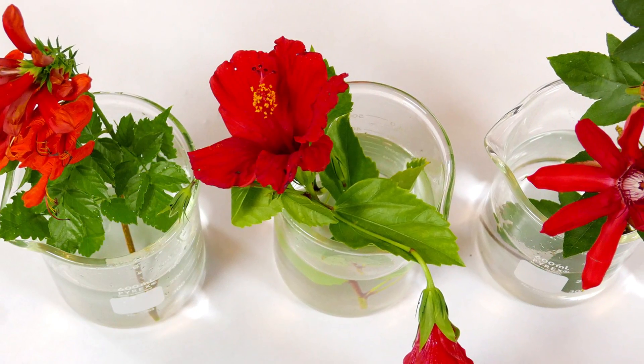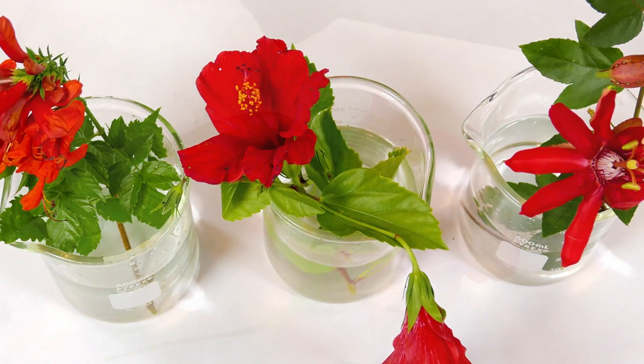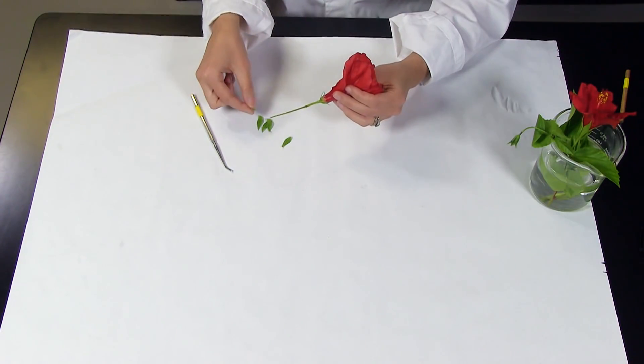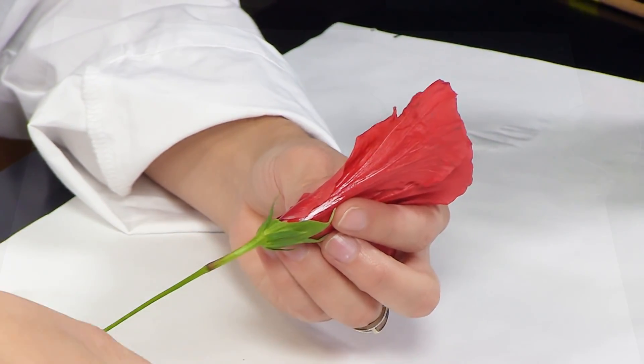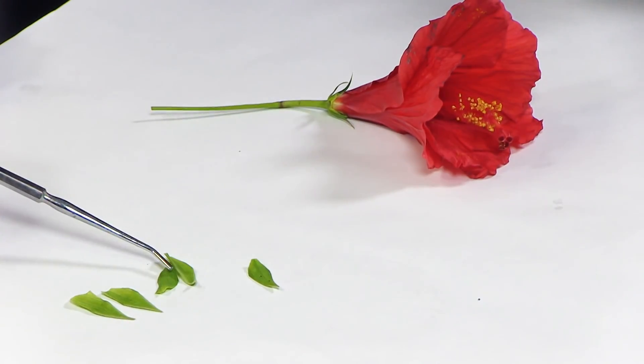You'll need three different types of flowers to complete this lab. Your flowers may look different than the ones in this video but they'll have the same parts. First, pull off the sepals of each flower and count how many there are.